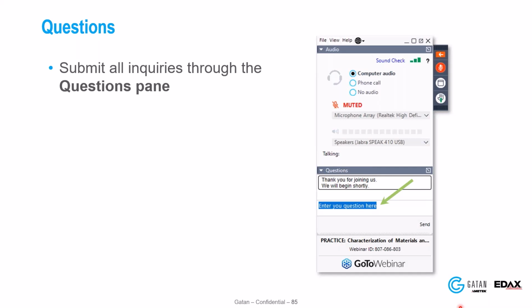If it's a weld sample, I put in just the nickel when I was collecting the data. I didn't even add the other 5 or 6 phases. I'm just going to collect nickel, then process it all offline, because with multi-phase samples, if you have 7 phases, your indexing has to repeat 7 times, and so it's slower online. So I generally won't do that online.